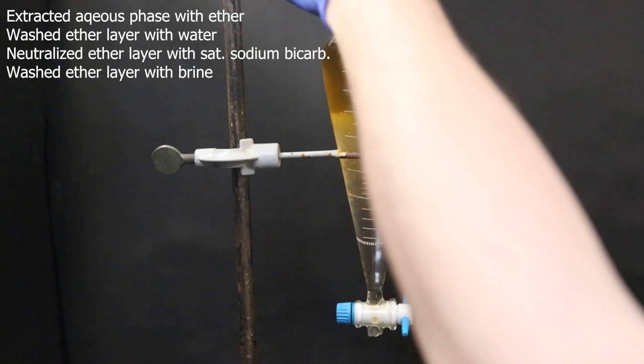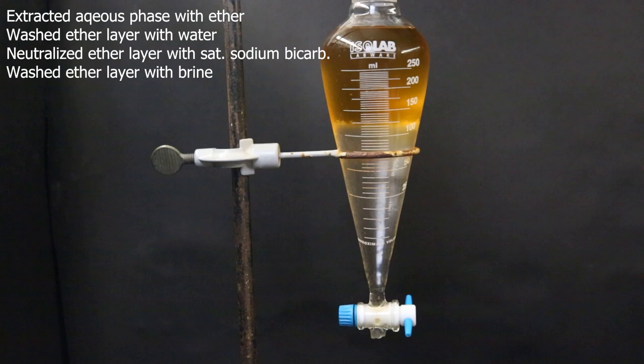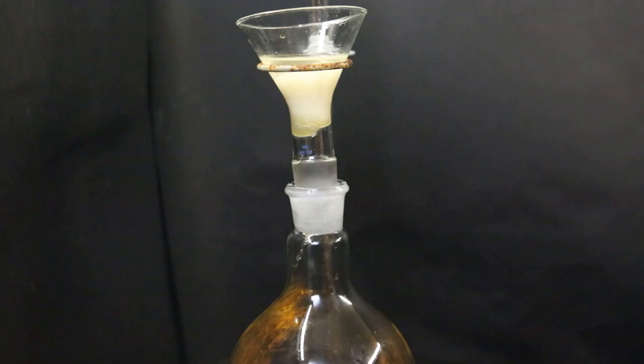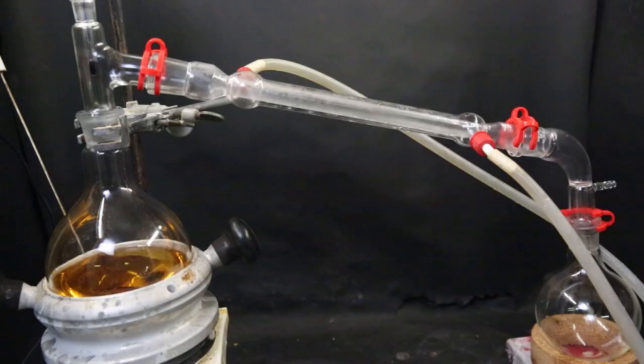After that, I put all of the ether layer into a beaker and added some sodium sulfate to dry it. Then I filtered it all through some cotton into a large flask and set it up for a regular distillation to boil off all of the ether. When all of the ether had come over, some dark oil is left behind.